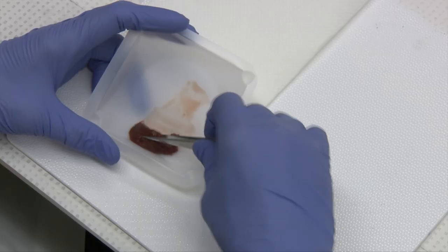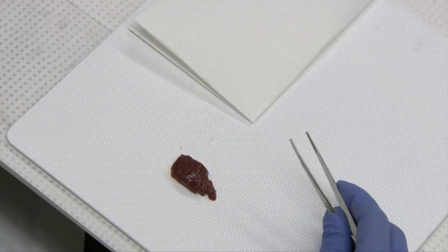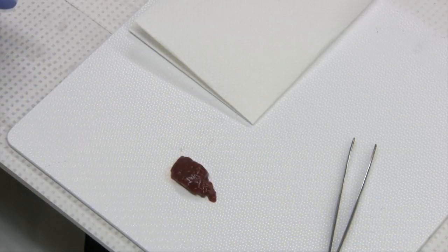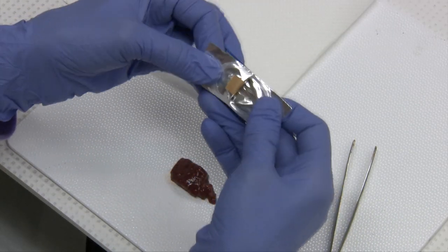So the first step we're going to do is to create a fresh cut on this tissue. I will take a scalpel blade and cut this tissue in about half.